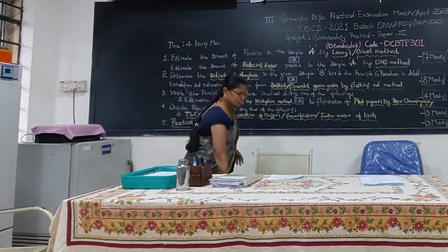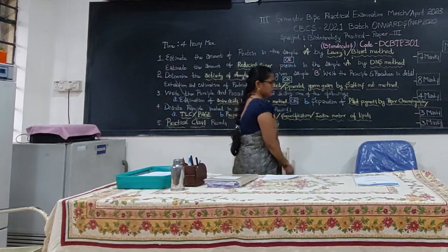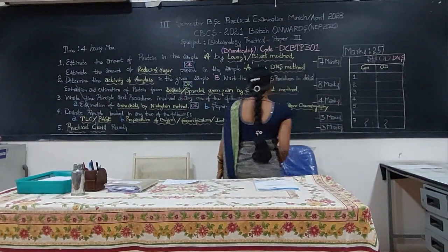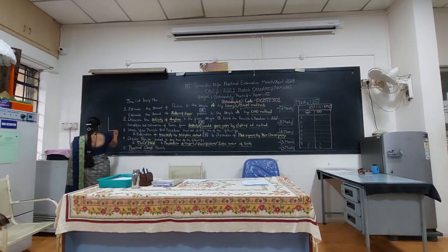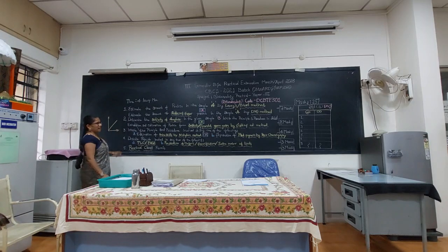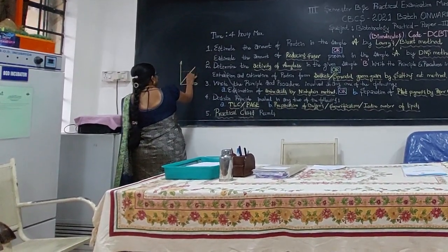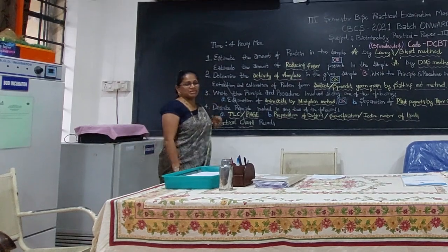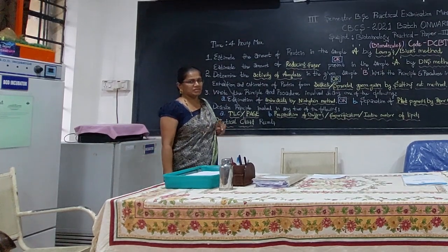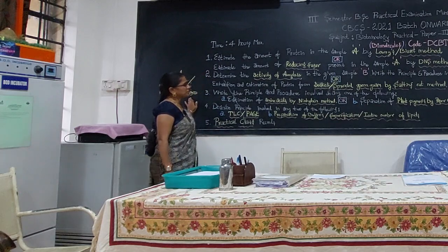So the standard will be given. Standard OD will be given. You need to plot the graph, x-axis, y-axis. Put the standard straight line, and the unknown sample OD you get, connect it with a dotted line so that you will get the unknown concentration. That unknown concentration is nothing but the 7th test tube unknown concentration. You need to write how many micrograms you got.